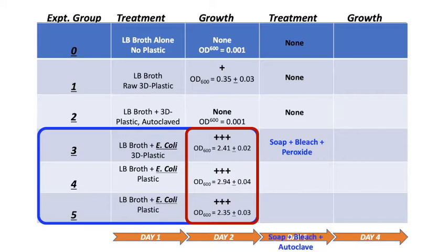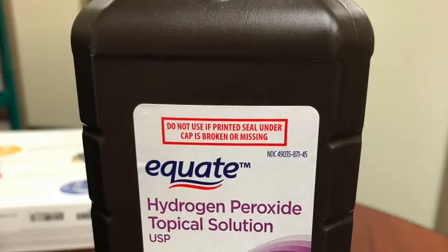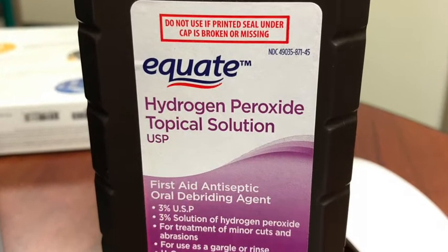Remember, the goal is to determine whether soap, bleach, peroxide, autoclaving, or all three is effective at sanitizing or sterilizing. For this experiment, I just used garden variety peroxide. Back in the shaker for another 20 minutes.